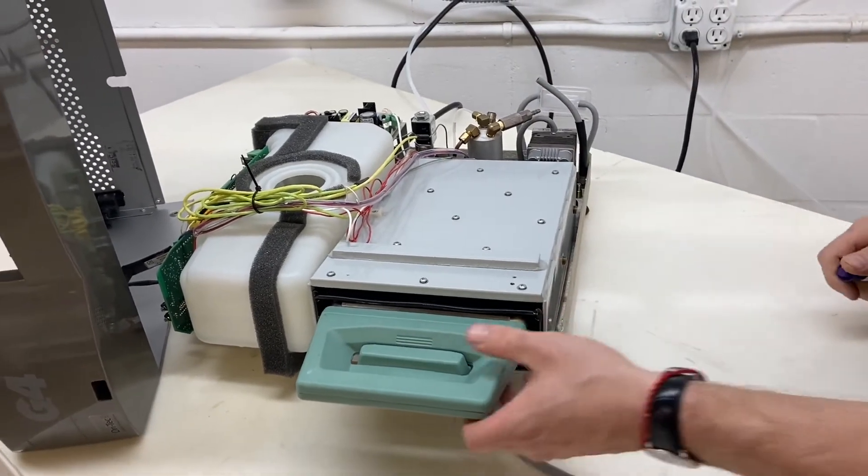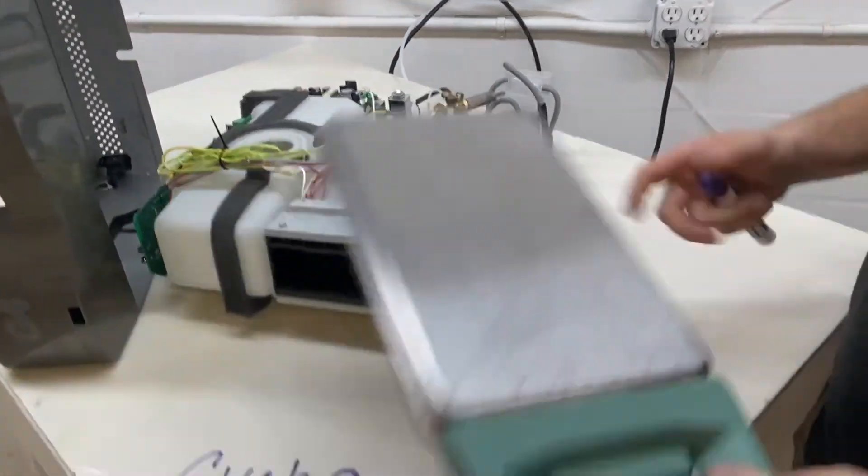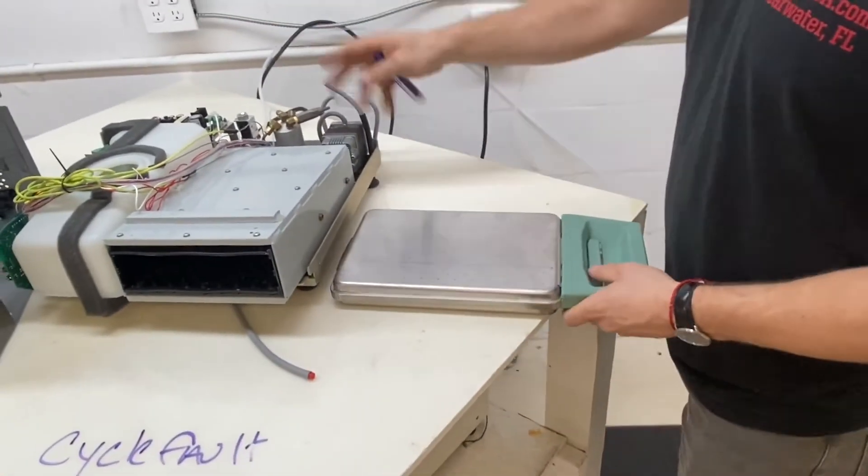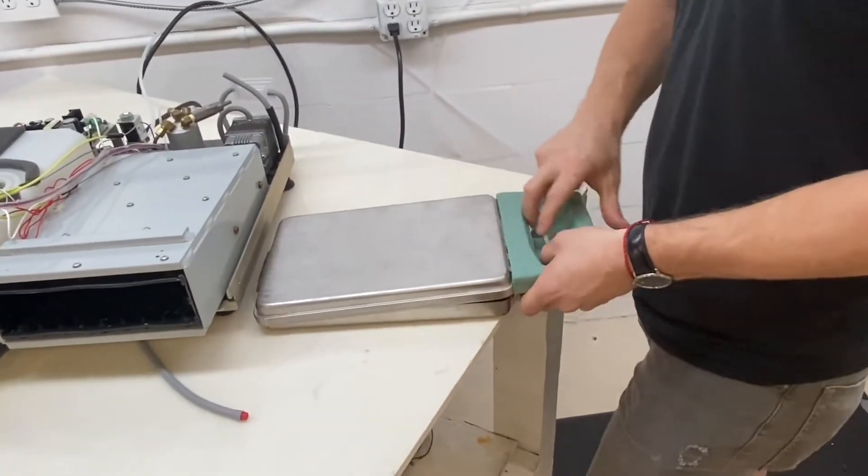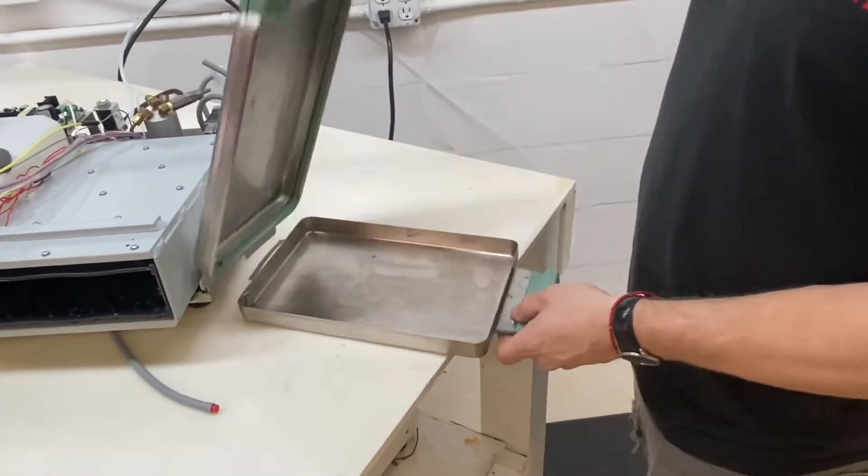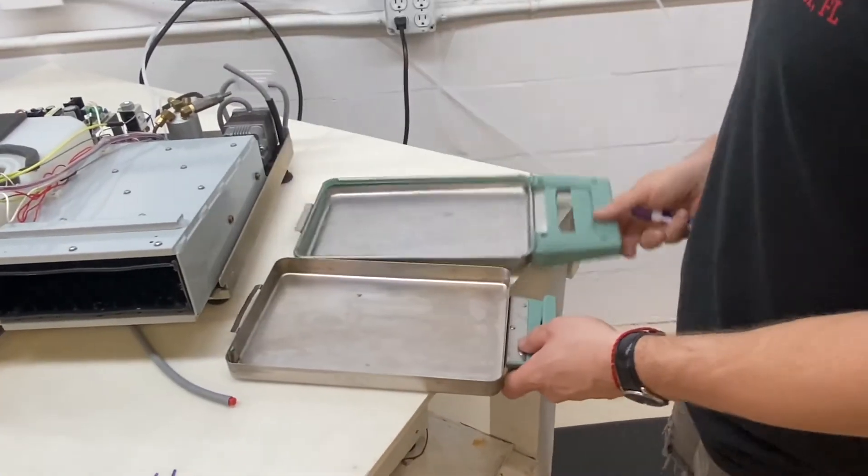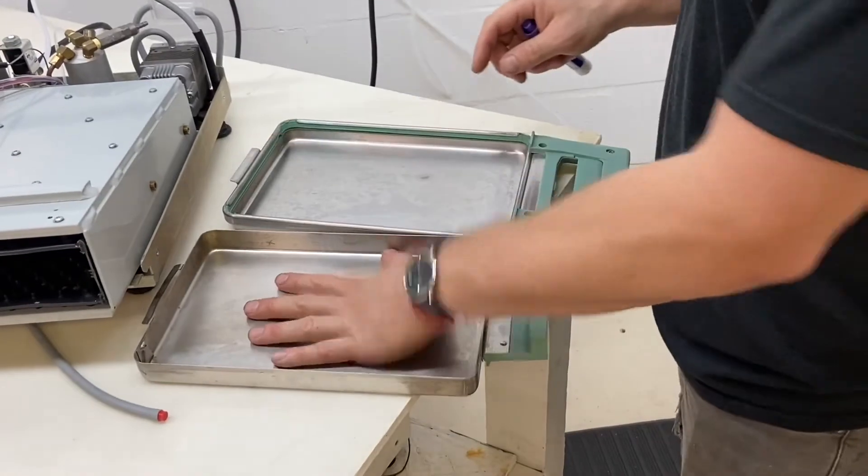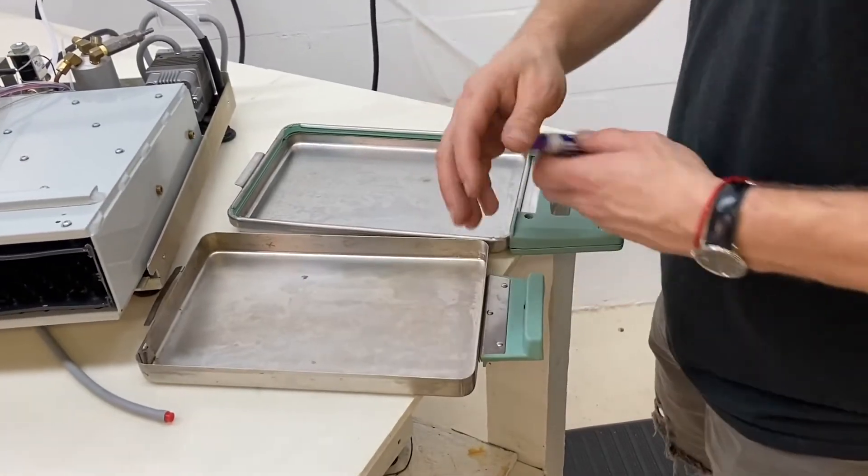Cycle fault number four. After we check the solenoid to make sure that it's clicking and sounding nice and firm, we're going to go to the cassette. We're going to inspect the cassette.